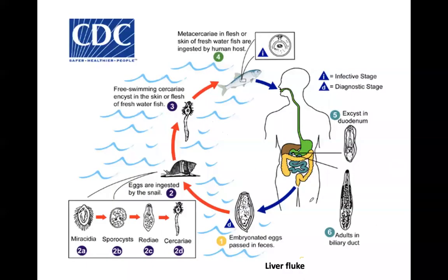And talking about these other parasites that we're looking at. This is most likely an intestinal liver fluke, I think. I don't know, this image is, oh, it's many different. So these are different liver flukes that can also be involved in the life cycle. And we were discussing, I think, yesterday on the stages. Someone was asking about sporocysts and what are rediae. So this is how it goes. You get a miracidia. Miracidia evolves to sporocyst. Sporocysts evolve to rediae. Rediae evolve into cercariae. Cercariae can now get out of the body of the snail to infect the fish, and we continue.